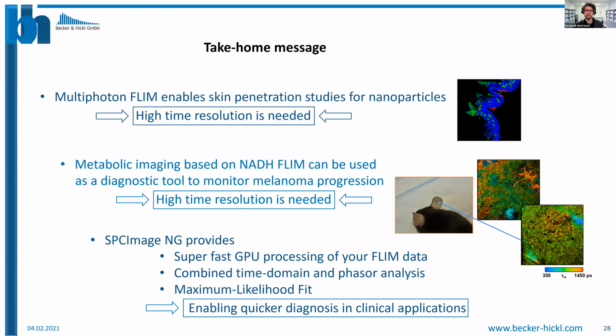With this, I want to close this talk. And in summary, multiphoton FLIM enables skin penetration studies for nanoparticles, but you need a very narrow IRF, instrument response function, and a high time resolution in your electronics so that you can really be sure that there's no penetration into the skin.